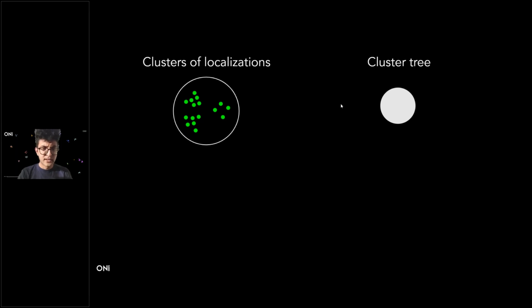Now, if we were to be a bit more stringent with what forms a cluster, and we say, okay, we're not going to allow things to be this far apart in our cluster, let's maybe break it down a different way.